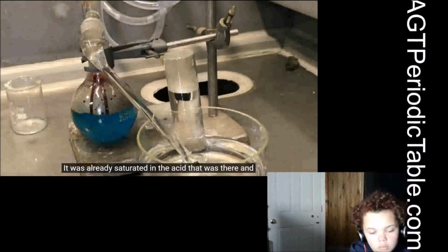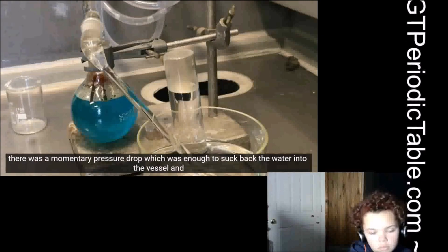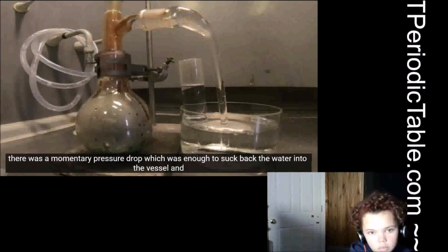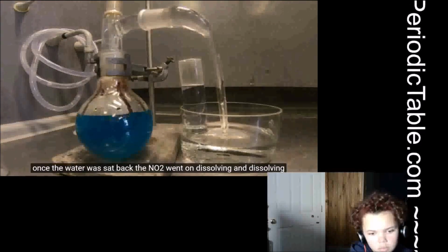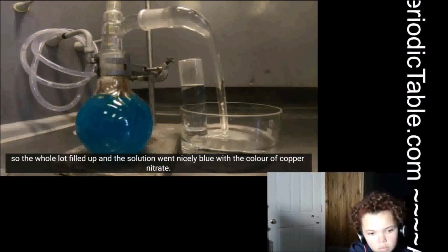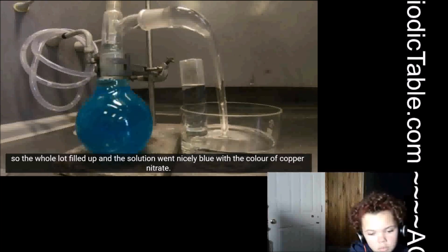It was already saturated in the acid that was there, and there was a momentary pressure drop which was enough to suck back the water into the vessel. And once the water was sucked back, the NO2 went on dissolving and dissolving, so the whole lot filled up. And the solution went nicely blue with the colour of copper nitrate.